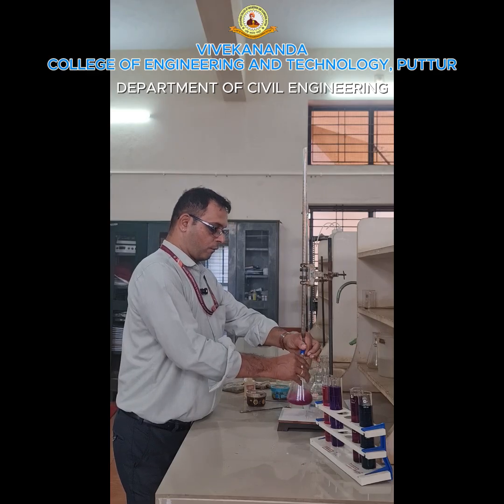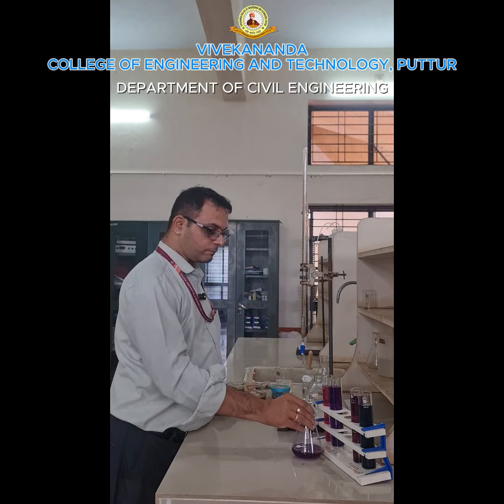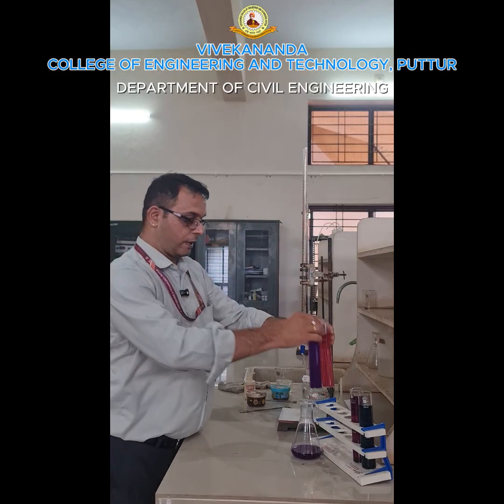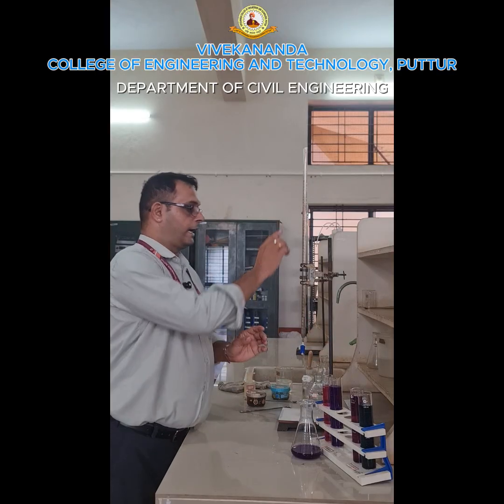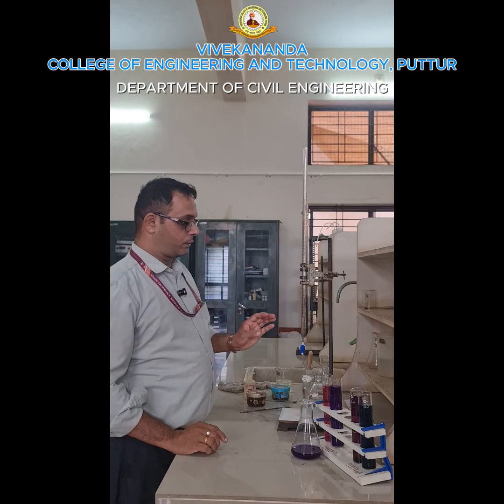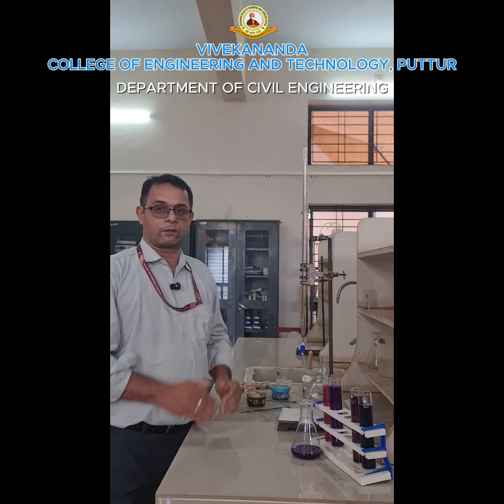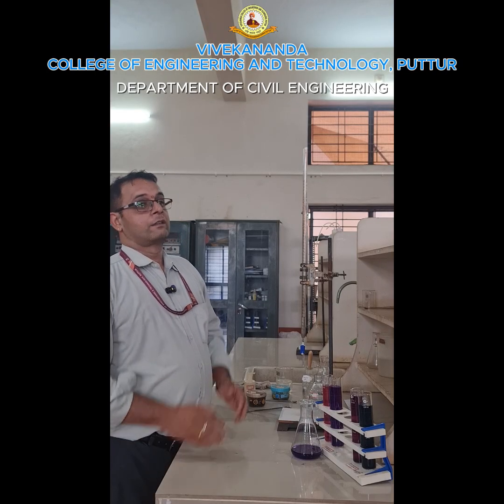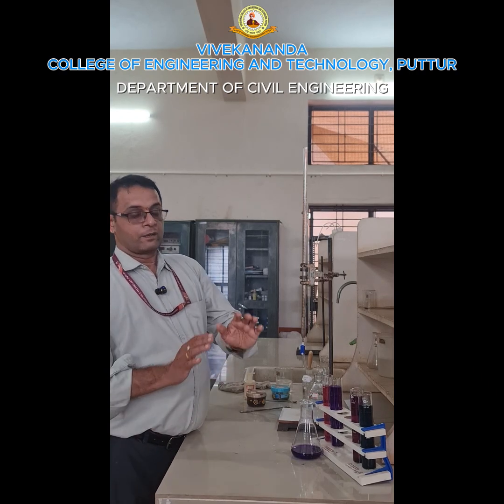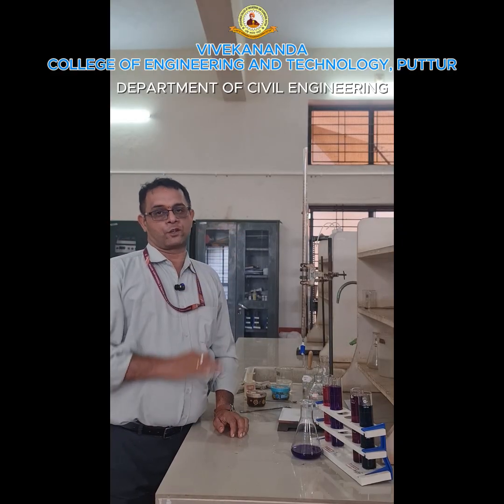Until the color becomes violet. Now the color becomes violet, right? So now you can see initial color, final color, initial color and final color, right? Once again note down the consumed EDTA solution, 3 trials, I will take the average, then I will calculate initially the calcium hardness, then using total hardness minus calcium hardness you will get the magnesium hardness. That we will see in the tabular column as well as in the calculation part.